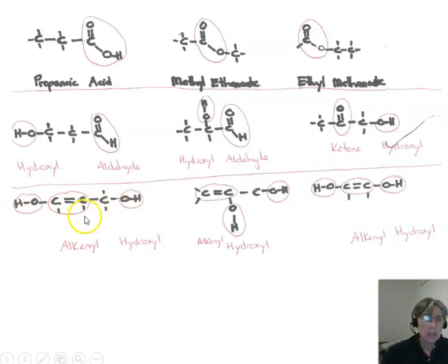So whenever you're quoting, if you've got an alkene and it's unsaturated, you can't just write in words, oh, it's got a double bond. You have to write it's got a C=C double bond. Yep. So in previous years they have given, as the molecule that you're trying to work out, this kind of combination, double bond and an OH. These are kind of the classic ones, but you might be asked for a ketone or an aldehyde or this double bond.